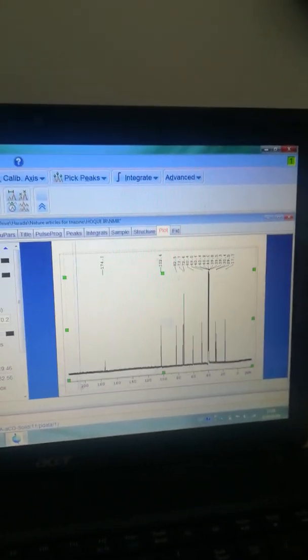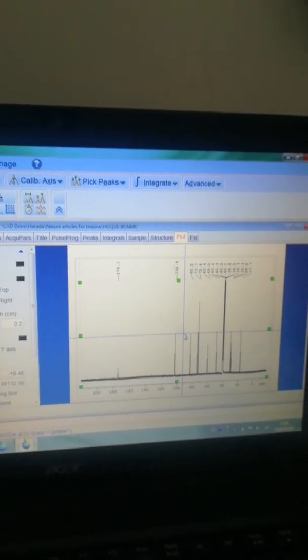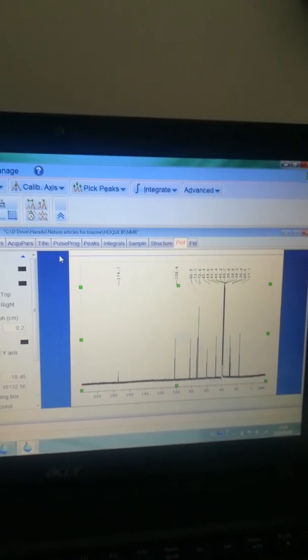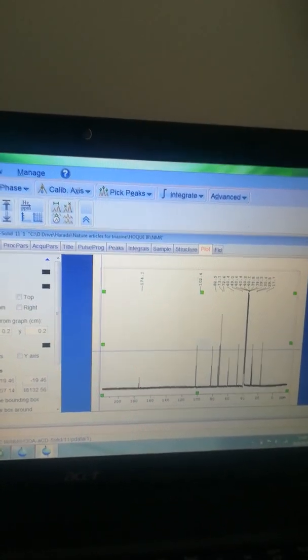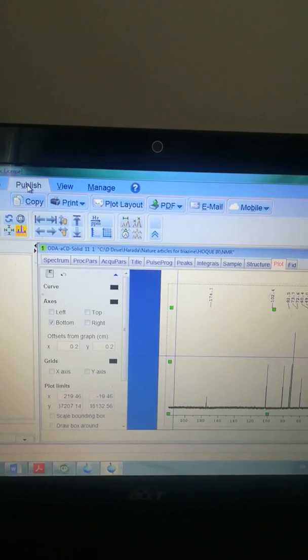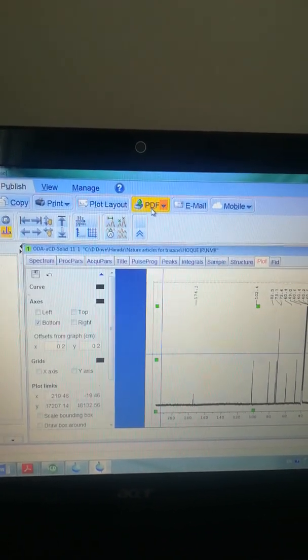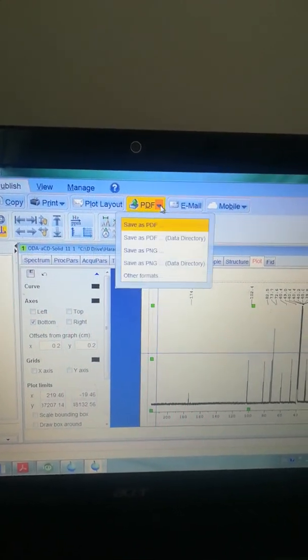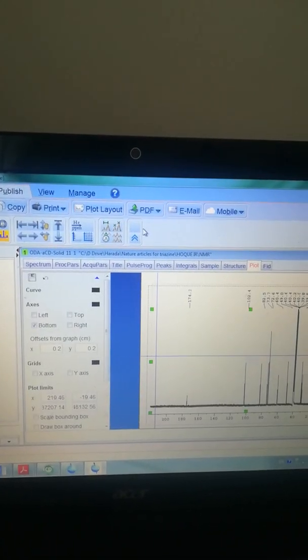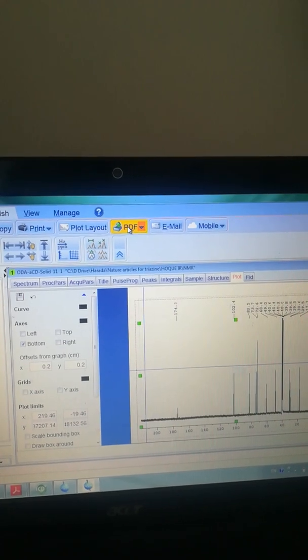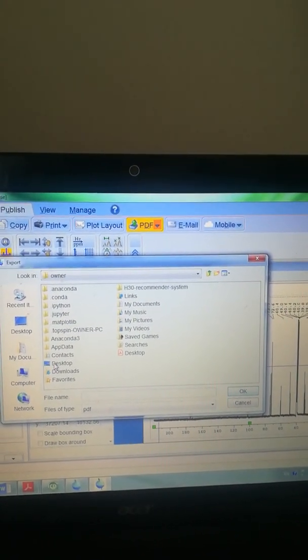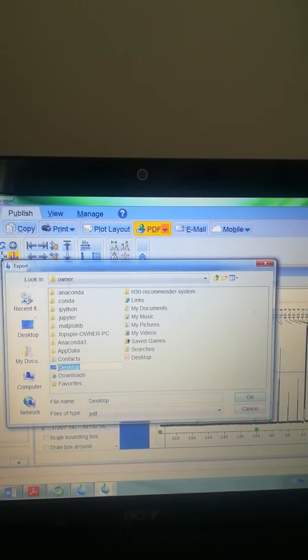Now I can directly select this spectrum using the mouse, and copy and paste it into PowerPoint or some other documents. Also, I can click the Publish option here — click Publish — and you will get a PDF option. Click here to save as PDF.